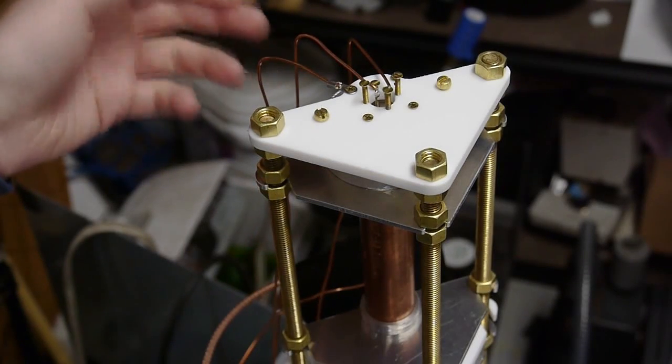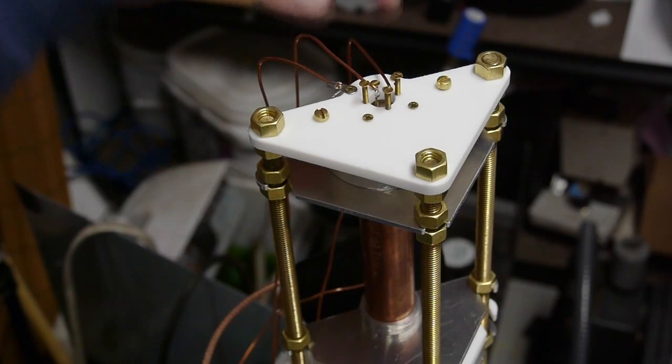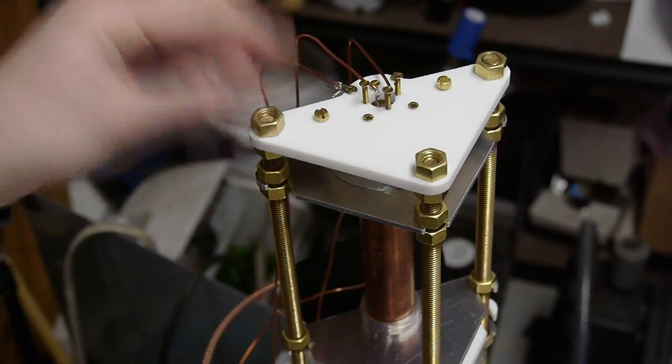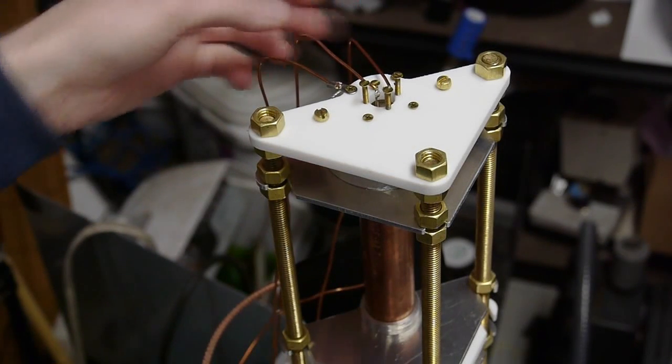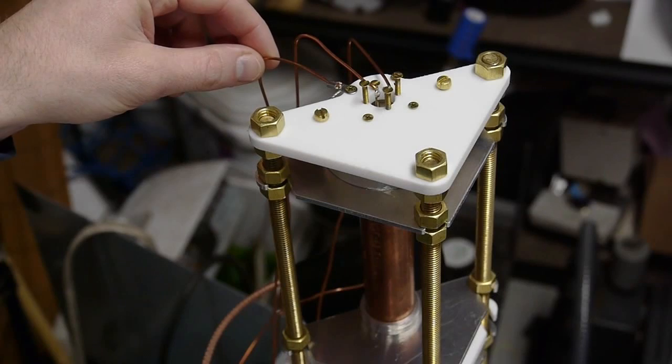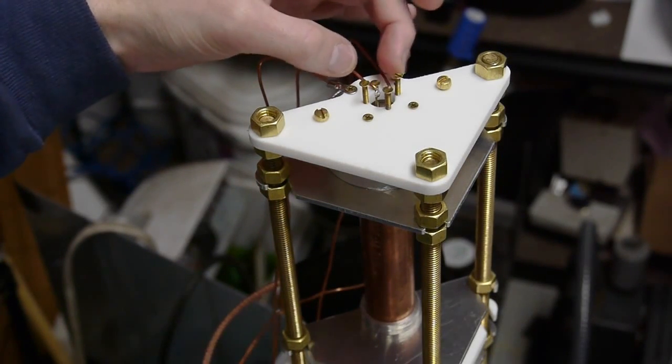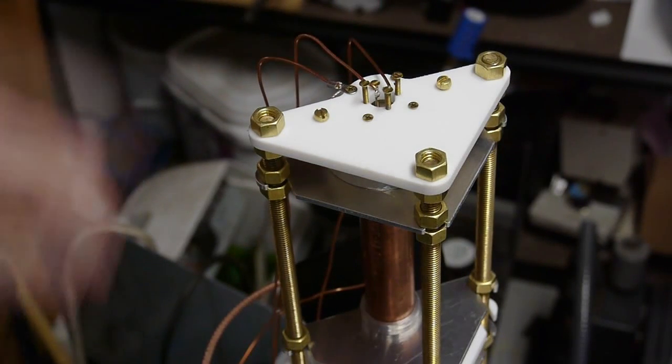And all of the metal in this entire microscope is the anode. So we're calling this zero volts ground. The Wenelt is, you know, negative five kV or whatever the acceleration voltage is. And the voltage on both of these is very close to about negative four thousand five hundred volts, or whatever the bias voltage is on top of the Wenelt voltage. And the voltage between these is about one volt at two amps, or two volts at one amp, or something like that, just to heat up the filament.